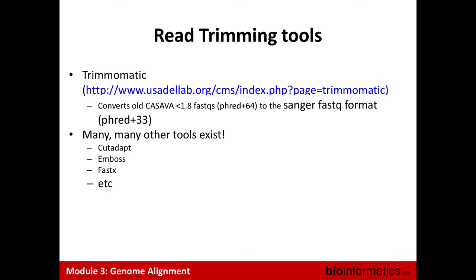Some of the tools allow you to look at the quality of the two ends of your reads. So it's more a question of features, because adapters, you will see, are not such a big issue, because now a lot of aligners support adapters. Given the same sample pool and quality threshold, they'll pull out the same thing? It should, yes. Okay.